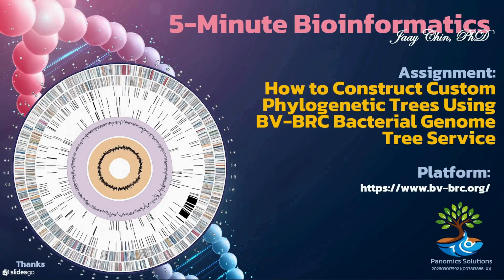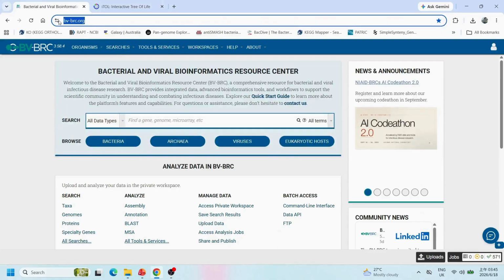In today's tutorial, we are going to learn how to construct custom phylogenetic trees using the BV-BRC Bacterial Genome tree service. We will also use iTOL, Interactive Tree of Life, to refine and polish the phylogenetic trees for better visualization and interpretation. By the end of this tutorial, you will be able to construct, customize, and visualize high-quality phylogenetic trees for comparative bacterial genomic studies.